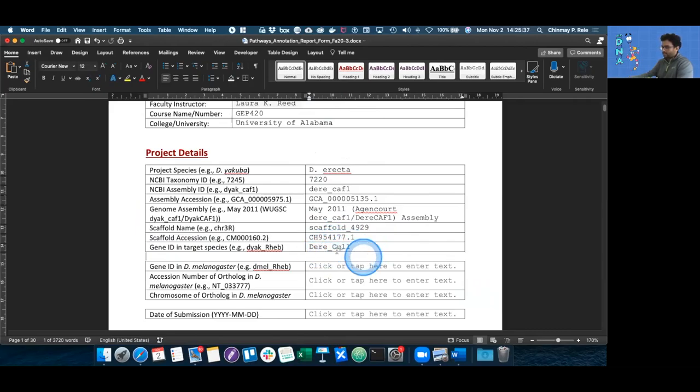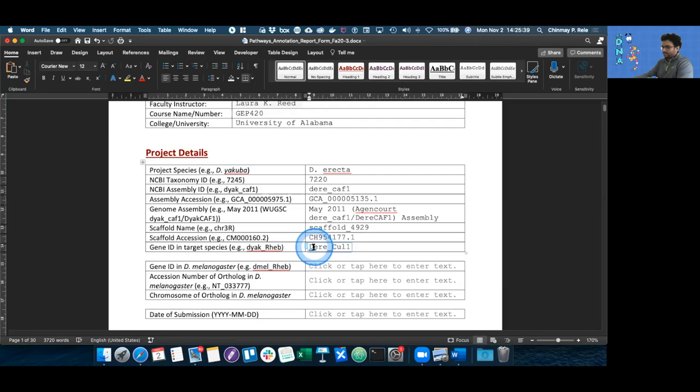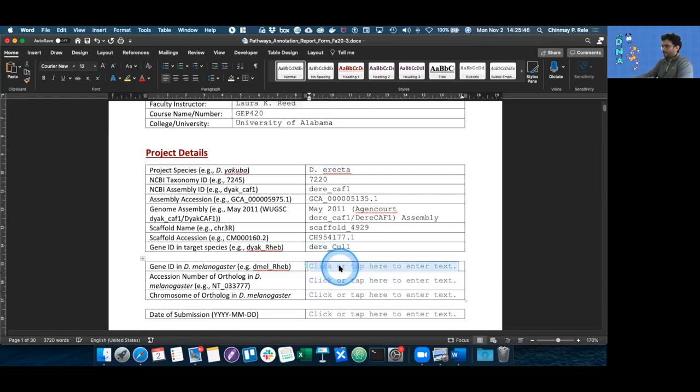But as you can notice, the D in Drosophila is large, and it's not what it should be. So we have to go back and correct it. Great.